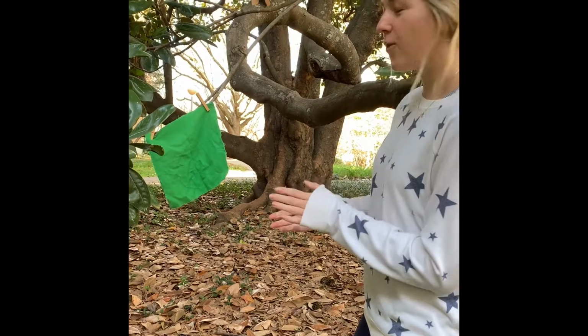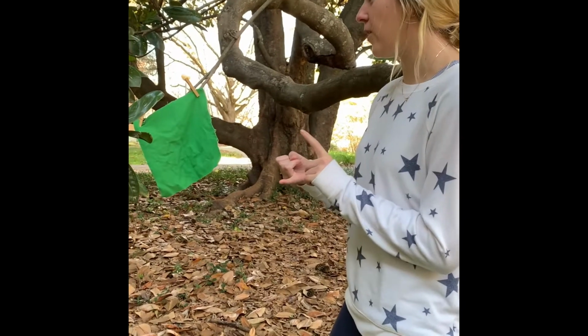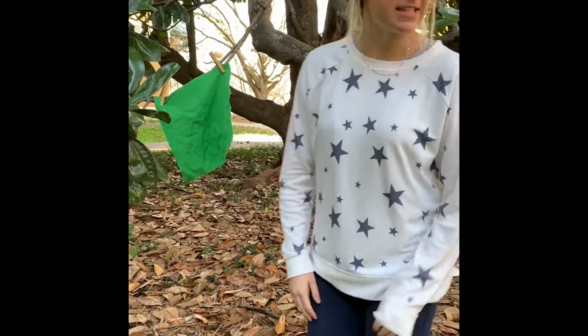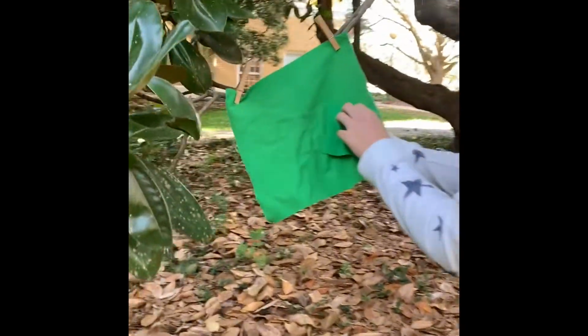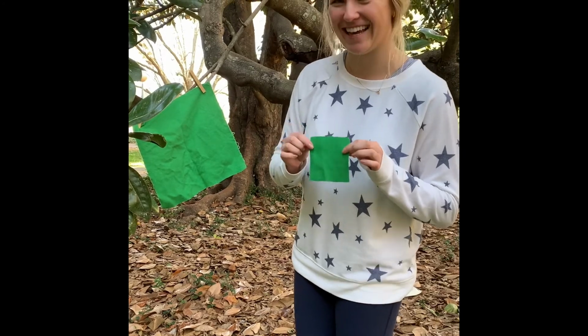And for our lab, it was exposed to the weathering conditions for 42 days or 6 weeks, in which there were several inches of rainfall. And while this is a decent amount of time, it gave the fabric a decent amount of exposure to all these different elements. And furthermore, as you can see, the change in color did occur in our fabric. While you may not be able to see it in this lighting, it did happen, and you'll be able to see it upstairs in the Spectralite Macbeth under daylight conditions.